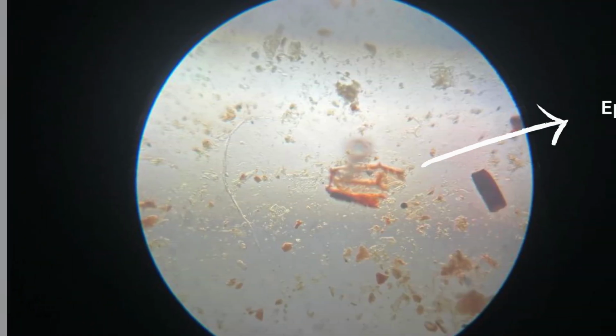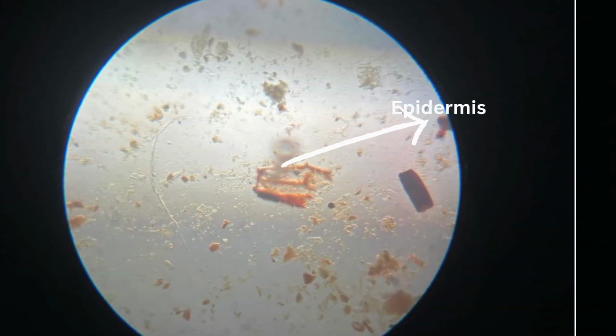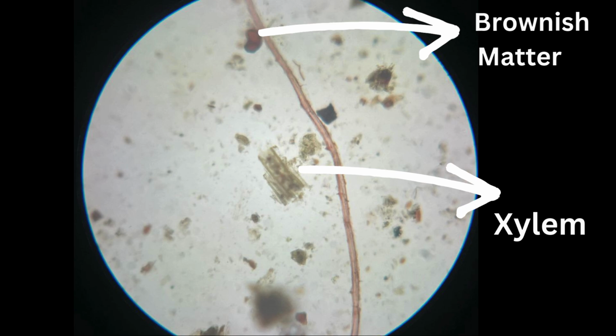Ephedra powder has distinctive microscopical structure comprising epidermis, fiber, xylem and brownish matter. Epidermis consists of quadrangular cells and its outer walls are ridged. Fibers are lignified and non-lignified, long and cylindrical. Xylem appears as tracheids with bordered pits. Brownish matter are abundant, dark brownish mucilaginous substance from pith.